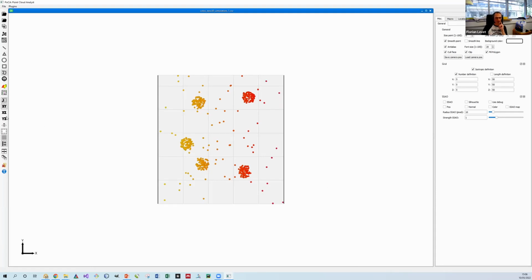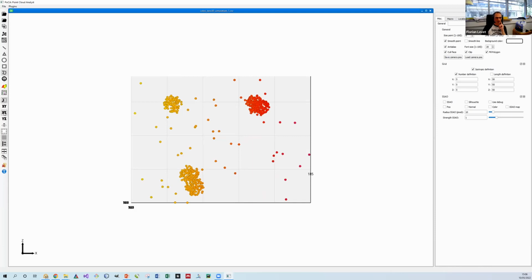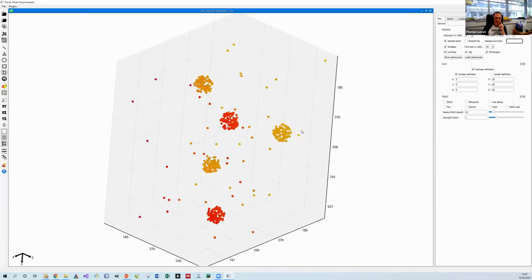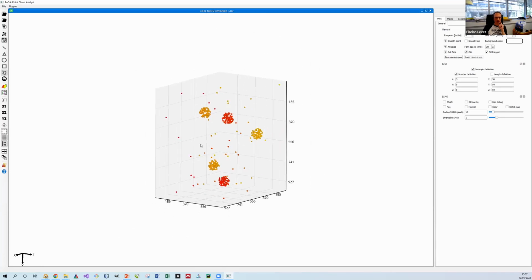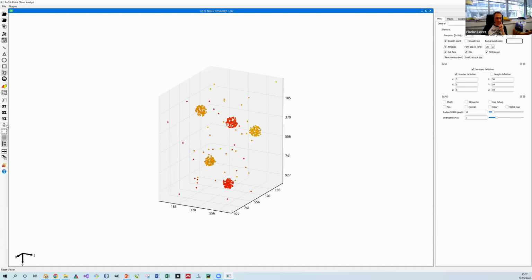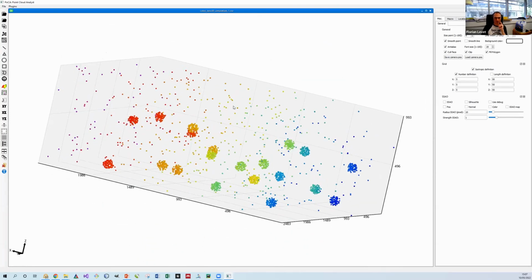And you will directly crop your data. And then you can go to this XZ frame and do exactly the same thing. And then if you click on XZ again, it will release the crop button and release the blocking of the rotation. And then you really have directly a cropping of your data, very easy, in order to go to some specific part of your data. Here, this is the button in order to reset the cropping, and you are back to the whole data.